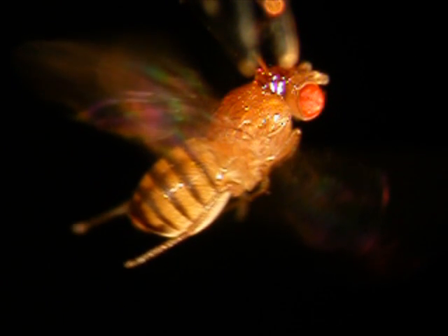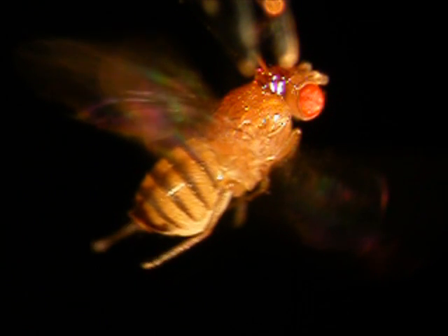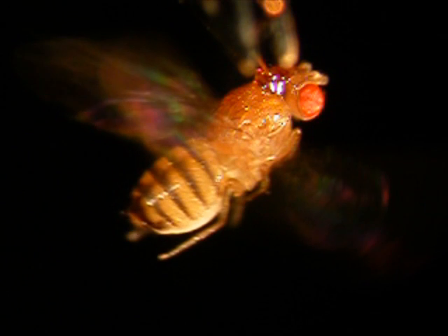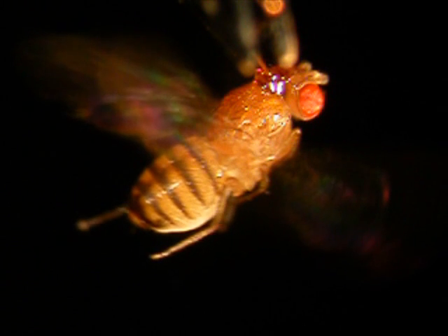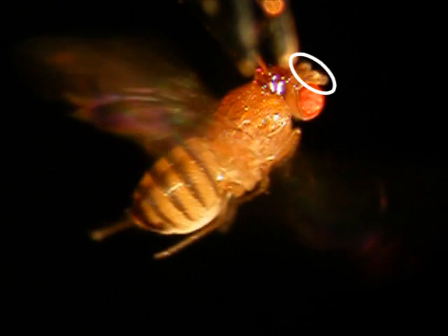This is the fruit fly Drosophila. As you can see, it is fixed in space by a drop of glue. In tethered flight like this, the animals are attempting to perform turning maneuvers which are accompanied by movements of their abdomen, legs, and even their antennae.